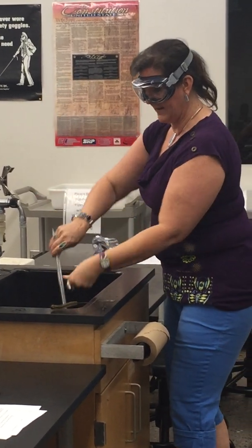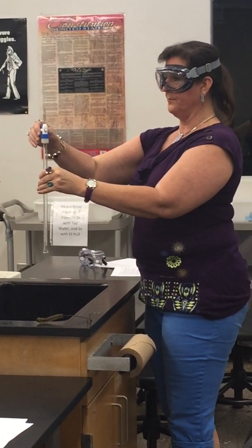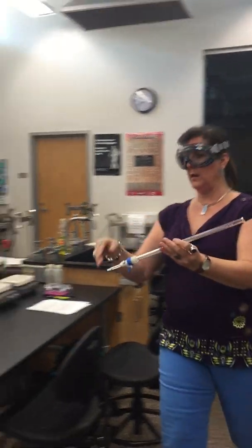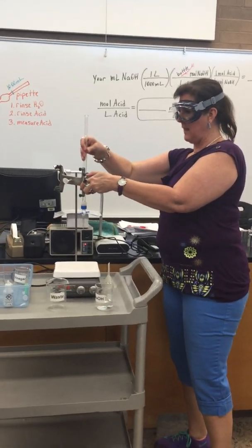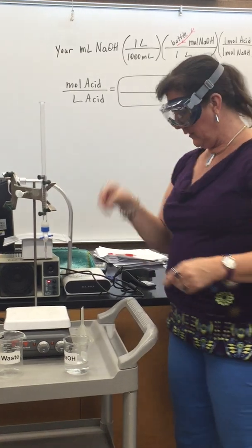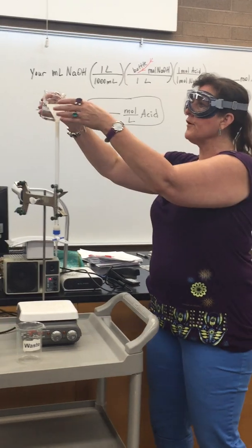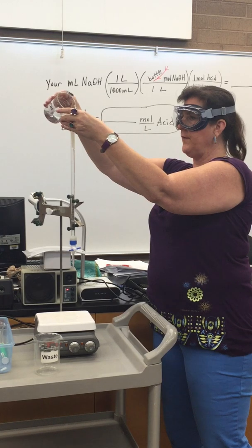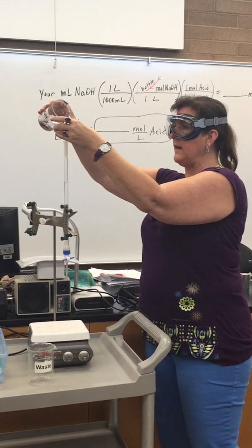Turn it upside down, open it up, and let it all come out — now it's empty. The burette has been coated with sodium hydroxide and is ready to fill. Clamp it one more time, make sure it's secure and closed. Grab the funnel and pour the sodium hydroxide slowly so you don't overfill it, filling up to the top close to zero or about one.